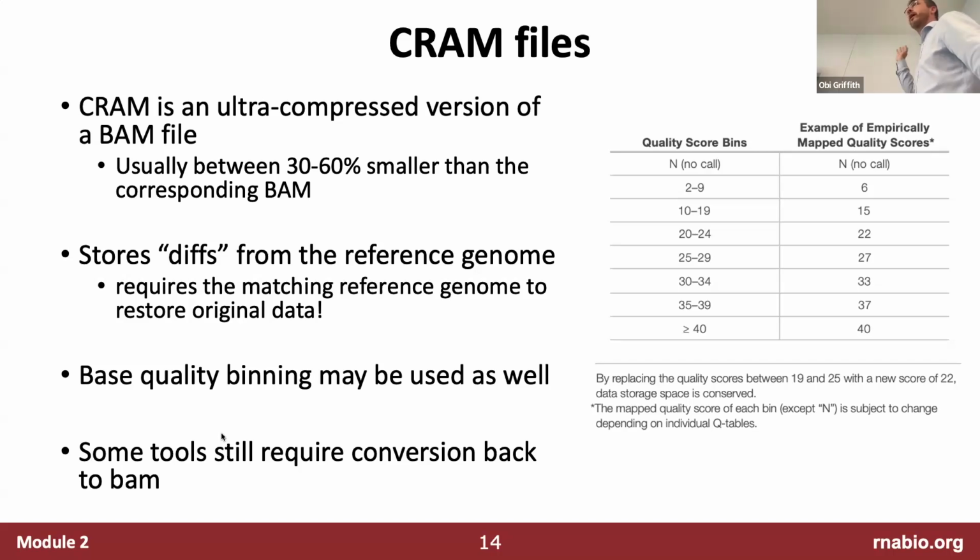If you need the sequence, go get it. So you're pairing the reference genome with the alignments and saving a lot of space by converting some of those alignments to lookups, instead of every row having to carry sequences, probably repeating the same sequence over and over, even if it's exactly the same as what's in the reference.